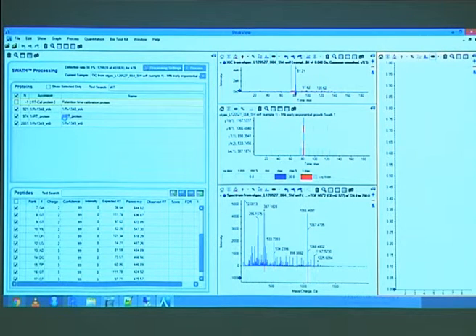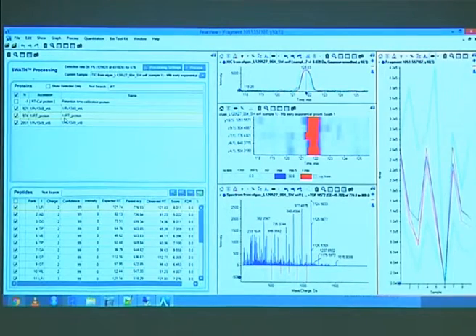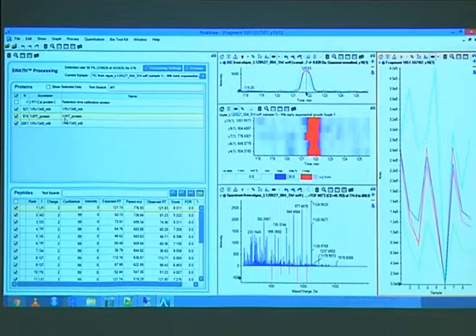So we look at the IRT protein. The retention time peptide up here, the one that I used to do the calibration, contains the same peptides. However, for the extraction, it only extracts peptides or proteins that have this check mark. And the retention time calibration protein has that unchecked by default. That's why it doesn't get exported.